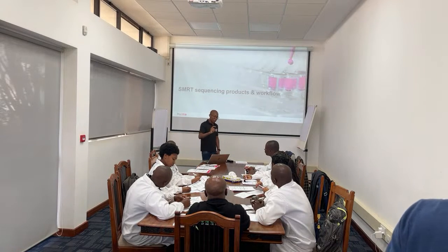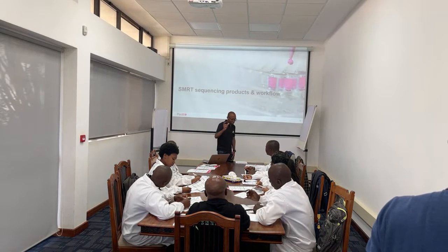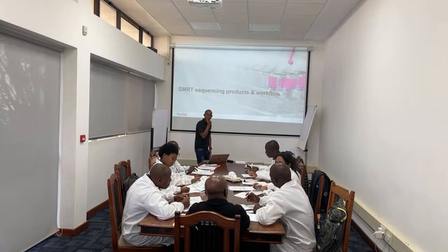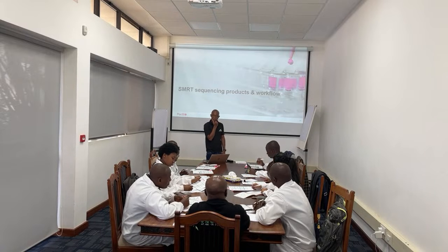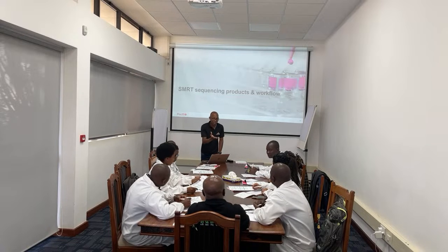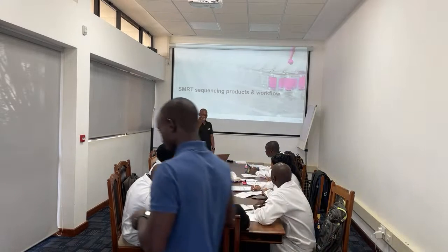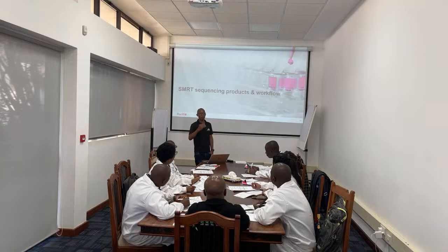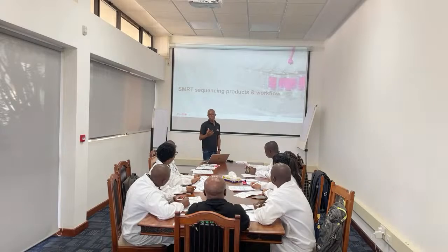So can you quickly do the math for me, just to say how much data we need to produce for this genome, from your phone, whatever. Let's say 2.4 multiplied by 30 times, 72 gigabases, right? Yep. That's the amount of data we need to produce. If this sample was from Africa BP, they come to us, we know every sample that comes to us needs a minimum of 30 times coverage. Then we will quote them for 75 gigs.